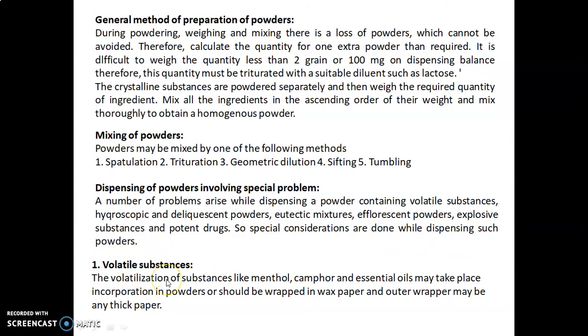Volatile substances. First problem is for volatile substances. The volatilization of substances like menthol, camphor and essential oils may take place.